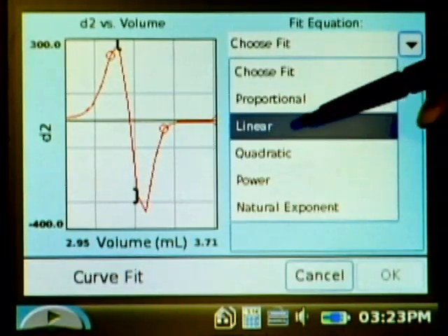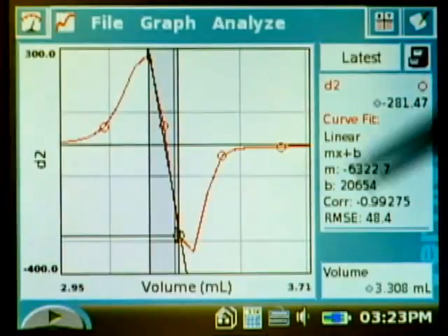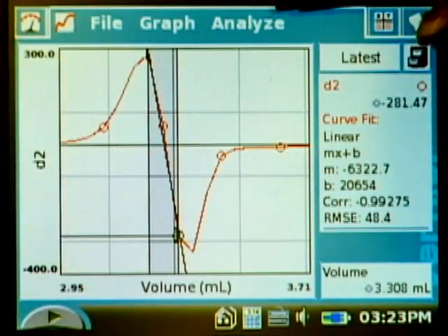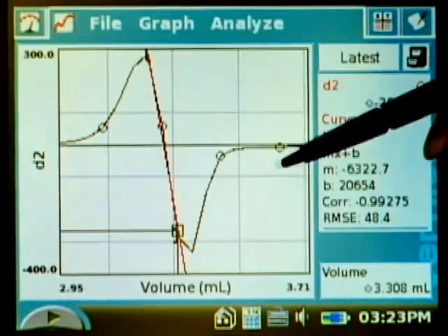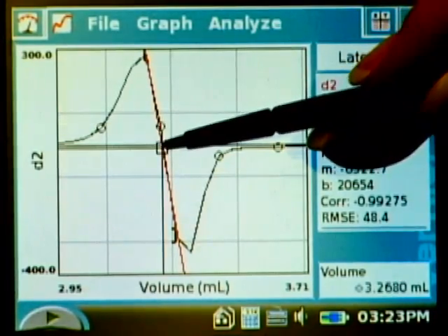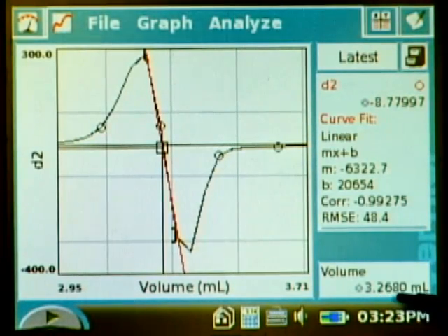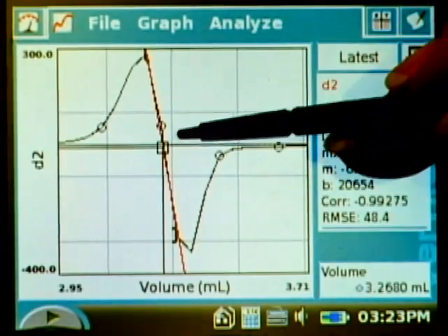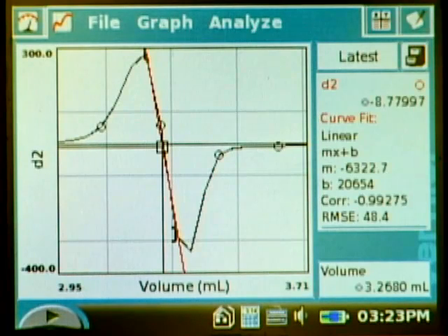So my fit is linear. All right, now that I have a linear fit, I can turn on interpolate and get very close to zero right there. Where I'm as close to zero as I can, my volume is 3.2680. So that gives us the exact equivalence point using the second derivative, which is probably the most accurate way to do that.